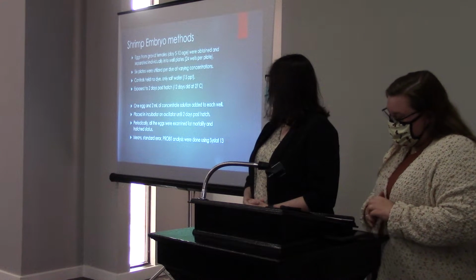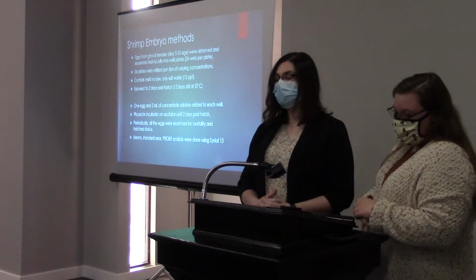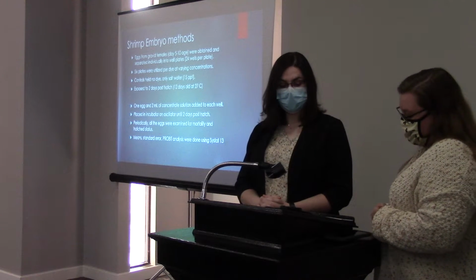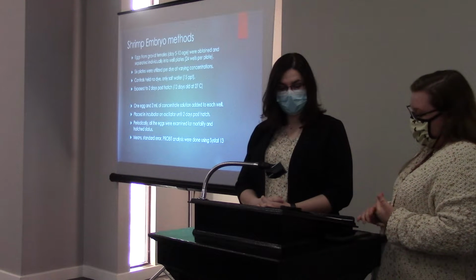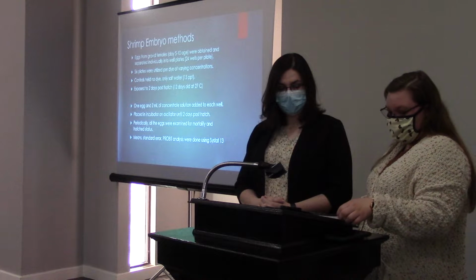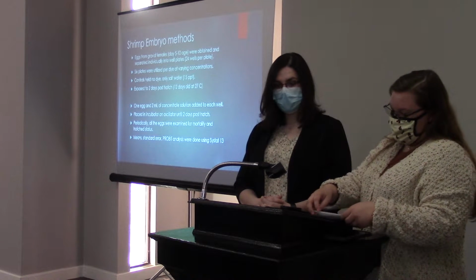Eggs from gravid females, about 5 to 10 days old, were obtained and separated individually into well plates, 24 wells per plate. 6 plates were utilized per dye of varying concentrations. Controls held no dye, only salt water at 15 parts per thousand.